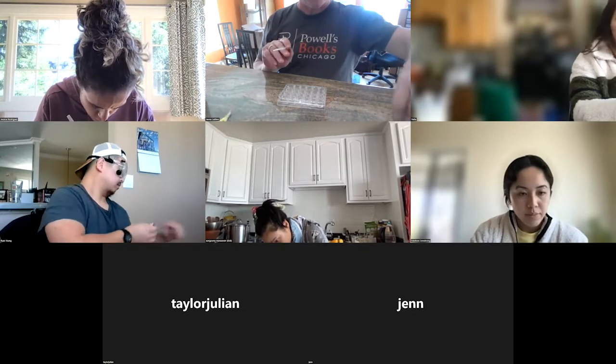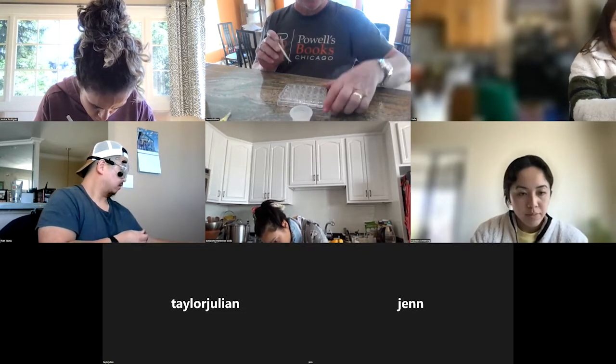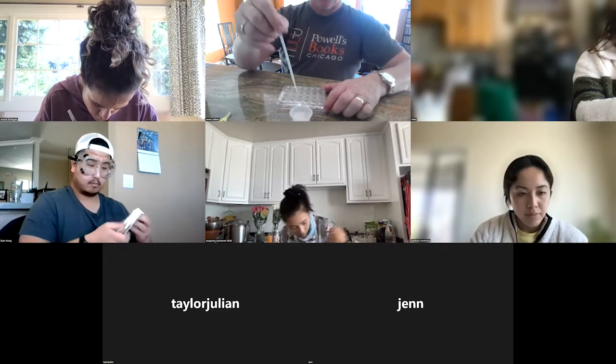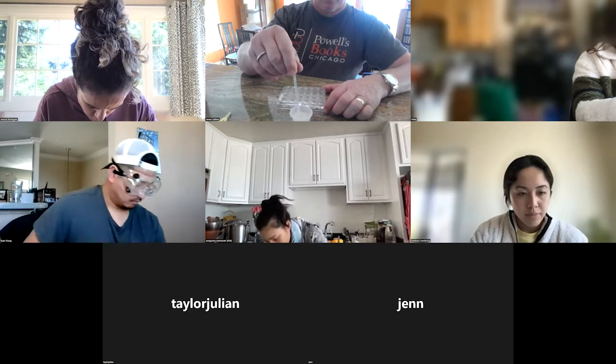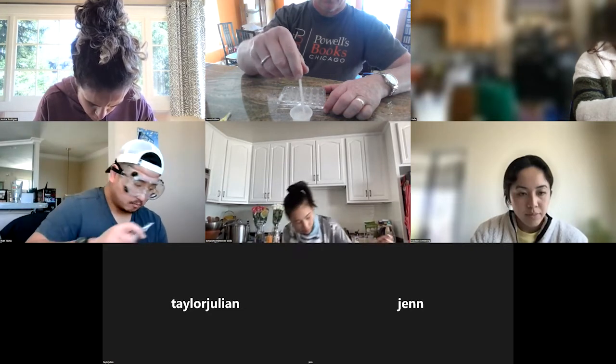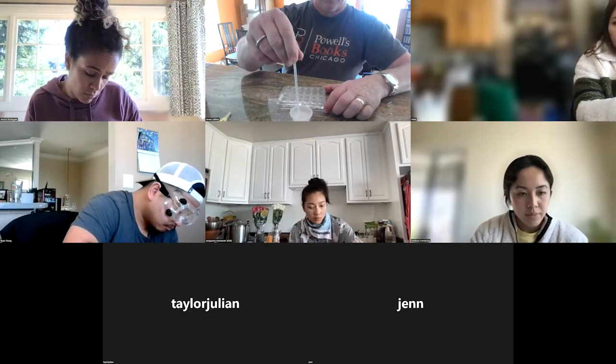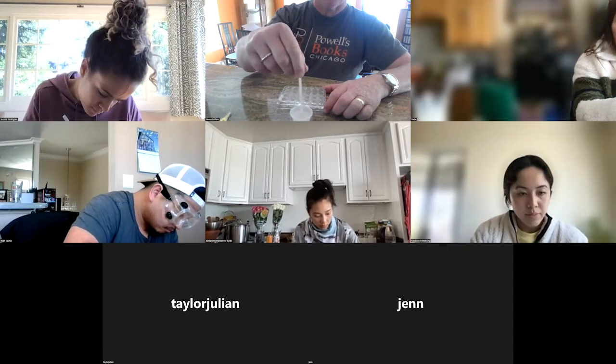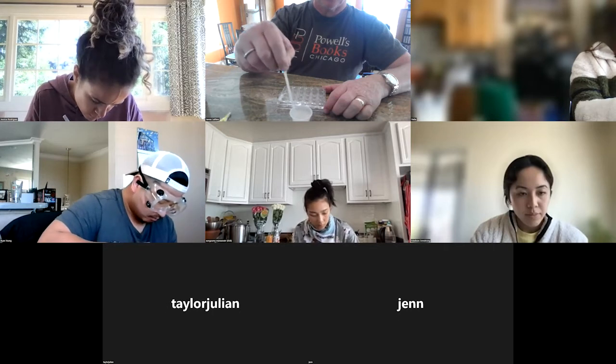And for the catalase, I just do the opposite. So I start with none, and then 5, 10, 15, 20. Don't be afraid to mix it up a little bit. Just make sure you have a nice even suspension.